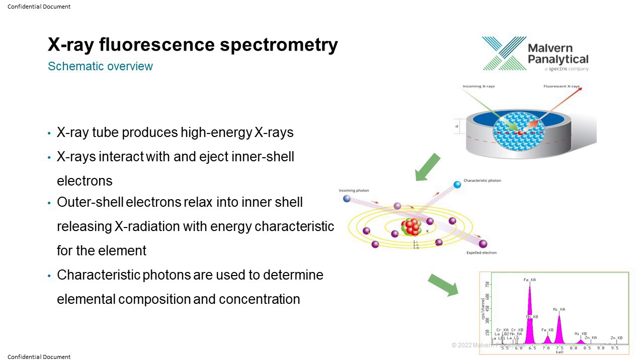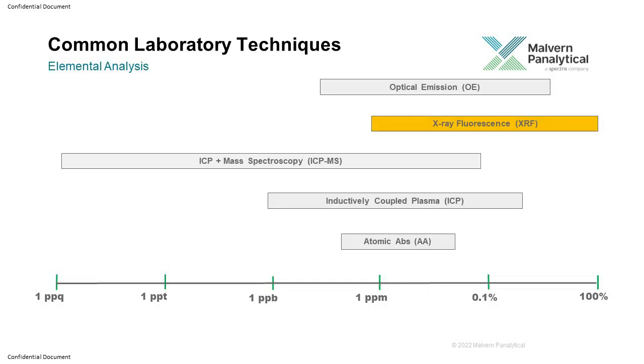So it can excite the X-rays from your elements, and then you get this kind of spectra, where every energy represents a different element. For example, at 6.4 keV, it is iron. At 7.5 keV, it is nickel. So you know at what energy these secondary X-rays are coming, and they represent different elements. And from the relative intensity of these peaks, you can find out their concentration. So this is in principle the technique.